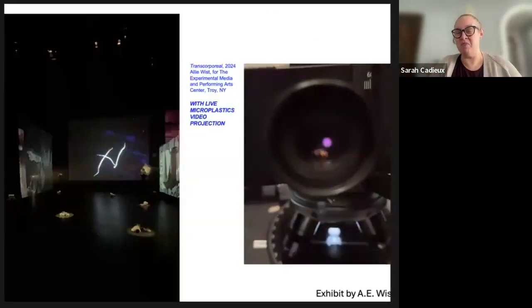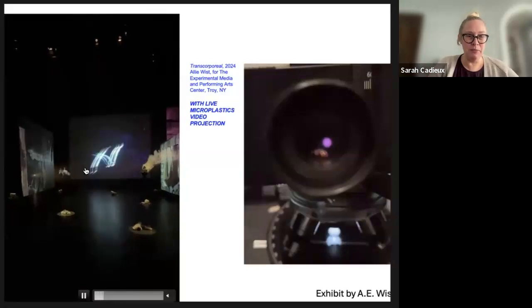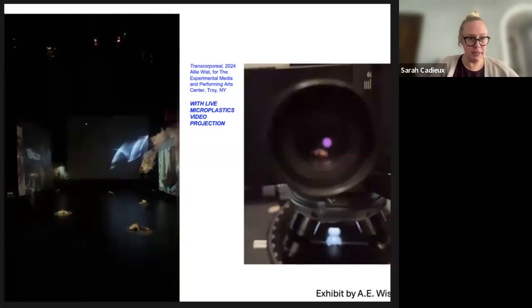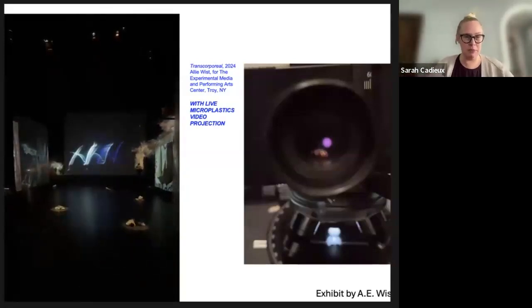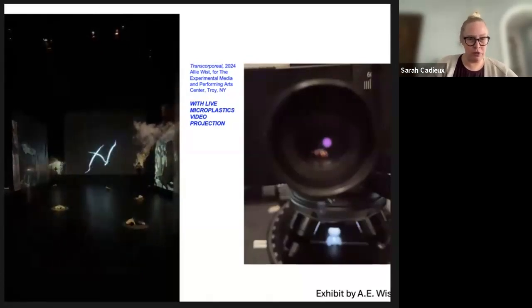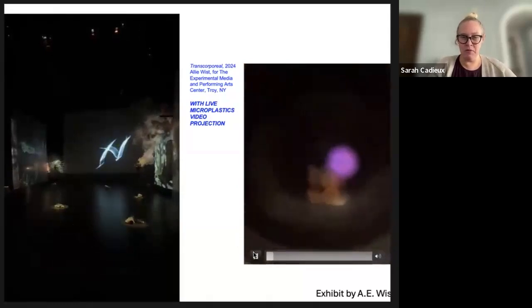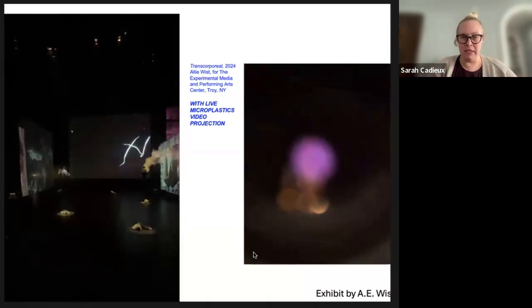So these videos, she did some live microplastic video projections. And also people were able to interact with the microscope and look at these samples that we had collected through the microscope as well. So let me show the projection first. So that's over here. On this big screen, you can see this is the projection of 2 fibers. There's a lot of other things going on as part of this exhibit. There are these big, huge screens that were also plastic with these images of microplastic projected on them. But this is the live microplastics video projection. And then this is an image. Oh, we'll talk first. So this is someone with their phone looking through the microscope, investigating the slide.